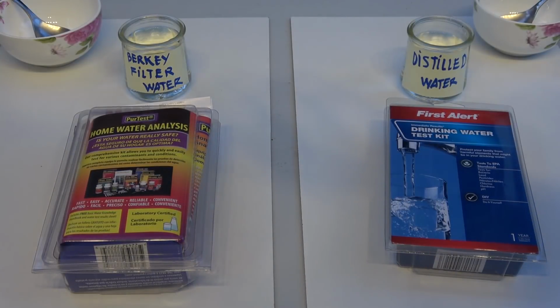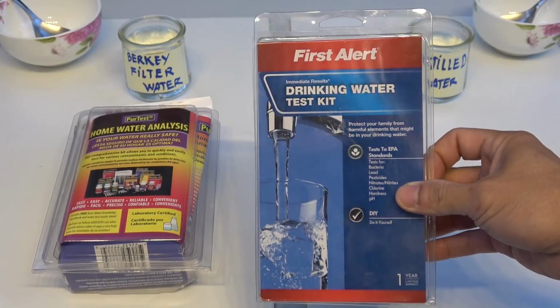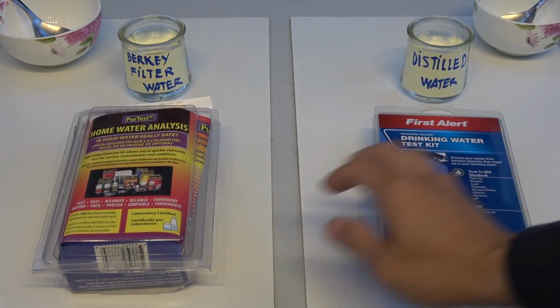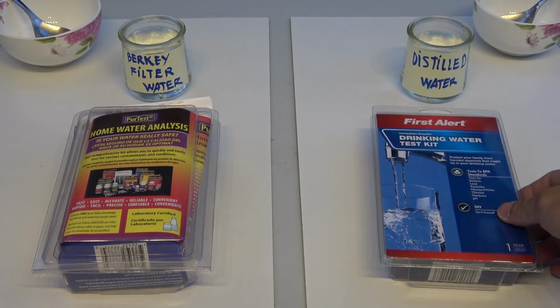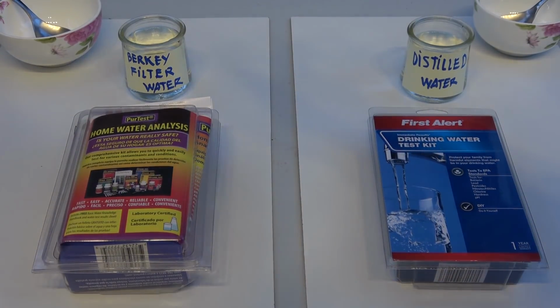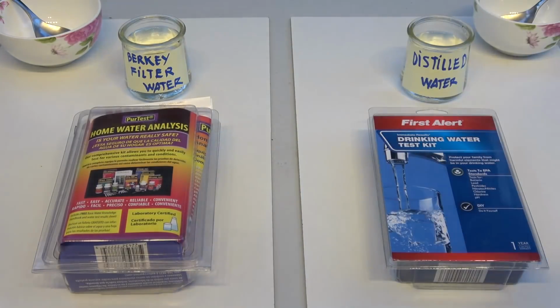Today I'm going to do a water test using these commercially available test kits. I've got a couple of different test kits here. These are usually sold in retail stores, and I'm going to do a test for my distilled water and my Berkey water filter.